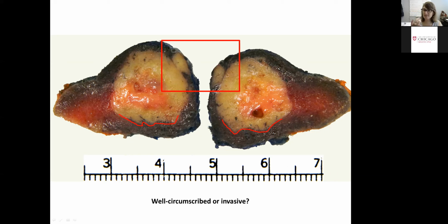So this is white, this is firm, this is solid. This has a little cystic area in the middle, okay, but that border is not kosher, all right? There's perhaps a little bit of pink in the center. That's probably just due to incomplete fixation, so it might be a little bit softer. Okay, fine.